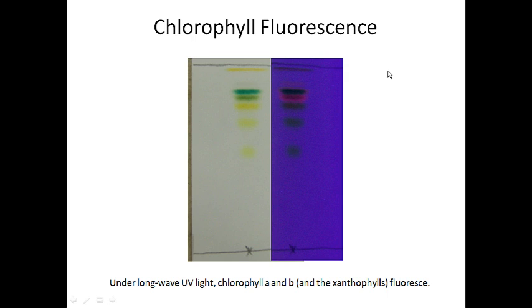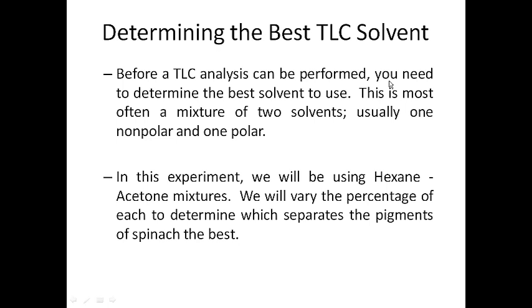Okay, so what we're going to do then to determine the best TLC solvent to use, and this has to be done before an analysis, and it pretty much is trial and error, is that you're going to basically prepare different hexanes, acetones mixtures.